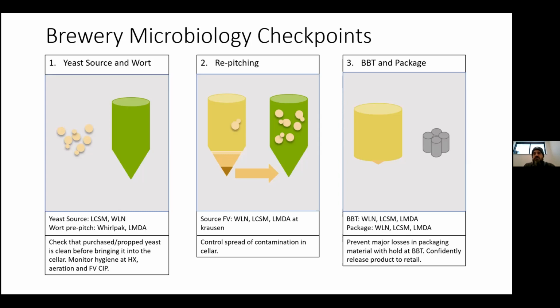And of course, you also might want to consider testing from each canning head. Again, if you're finding sporadic contamination, it could be down to a single head. So again, you really cannot do too much sampling. It's just a matter of the resources you want to put into it, the hours, whether you're going to have a person dedicated to doing this sort of sampling.